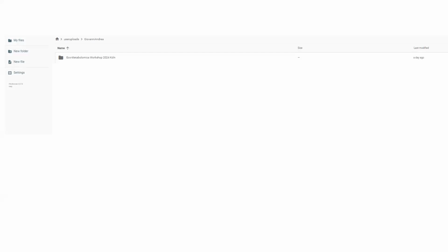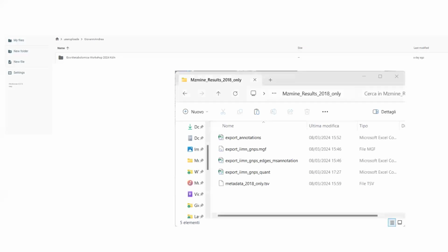Okay, great. So what we basically have to do: you have your file on your PC? Raise your hand if you have your file on your PC. Okay, they're not that heavy, so if you don't have them on your PC, you can download them very easily. Please do it, and you can just drag and drop them into the folder that you created.